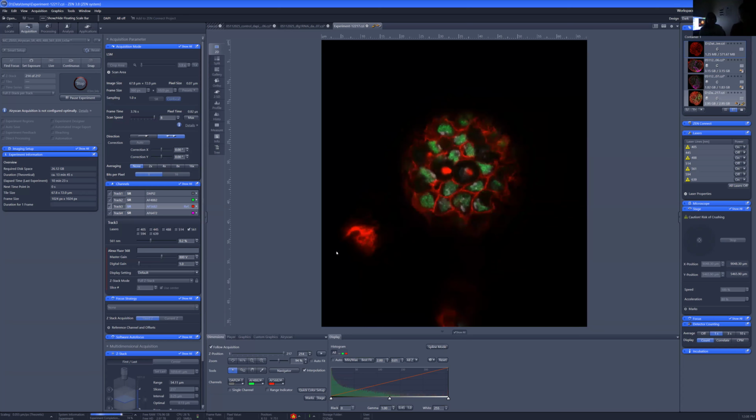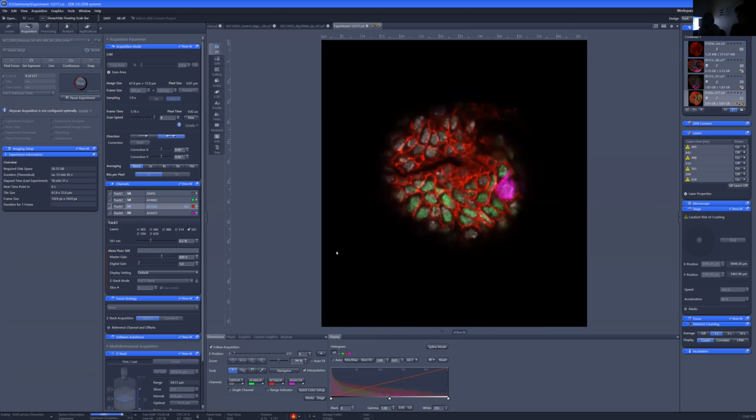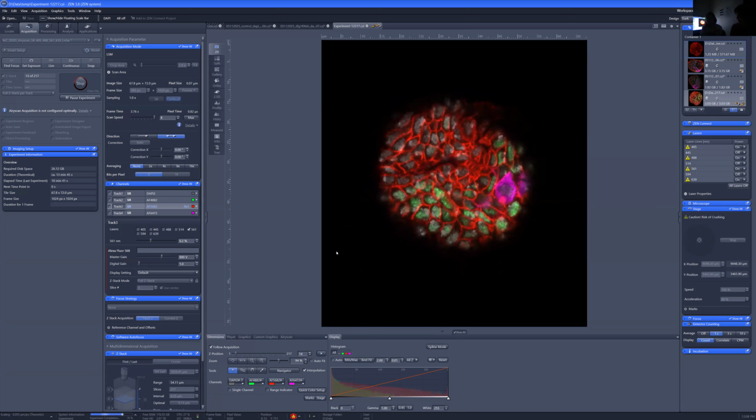Okay. And then there were 2 other things aside from the room temperature. Exactly. The glass slide itself was moving ever so slightly, and my sample inside the slide was also ever so slightly moving.